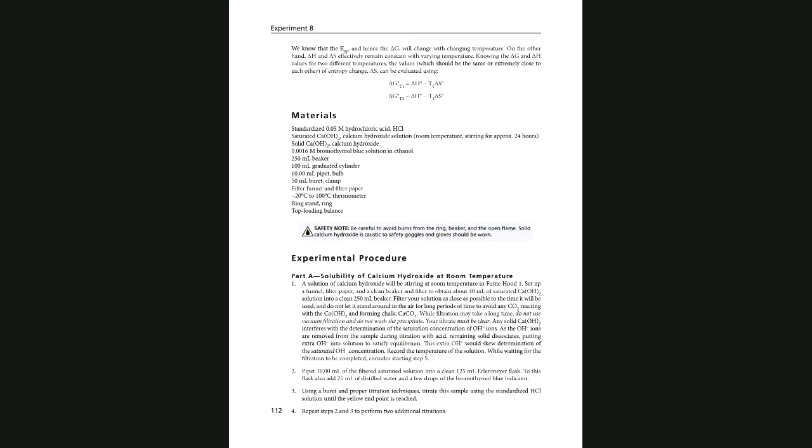So by this time, when I say initial reading, that means before I add any solution to my flask, it is the level of the standard in the burette. And if you have already looked at the data sheet, you know what items you need to record, which is a good idea to know before you watch the video. Make sure you read the experiment and answer the questions and the pre-lab assignments before you even watch the video.